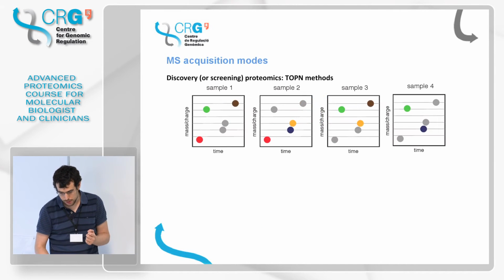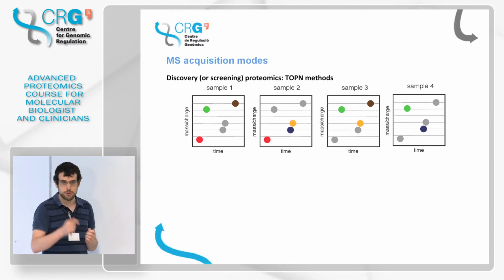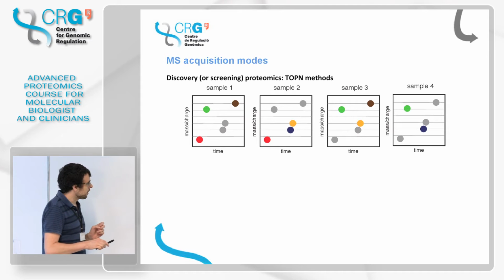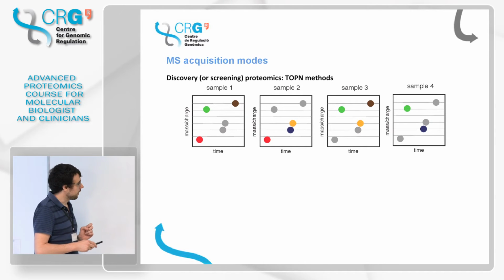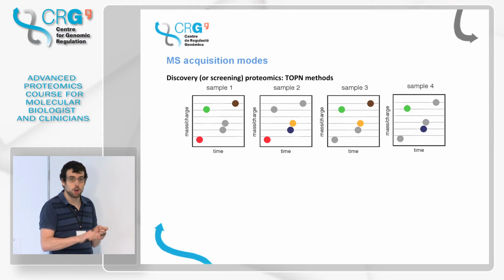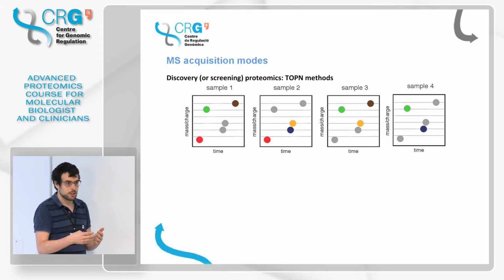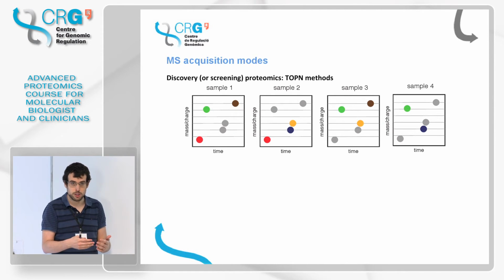And what happens with these screening methods is that when we have samples, because of what Geoffrey commented now, or also because of these sampling effects that we discussed before, if I have 4 biological replicates, it can happen that at the MS1 level I see everything, right? But at the MS2 level, the things that are identified are colored here, whereas the gray ones are not identified. So I can see that the identification here is these 3, whereas in the second sample, even though it's the same, I identified some other things, right? And this brings problems or challenges into protein identification and quantitation.